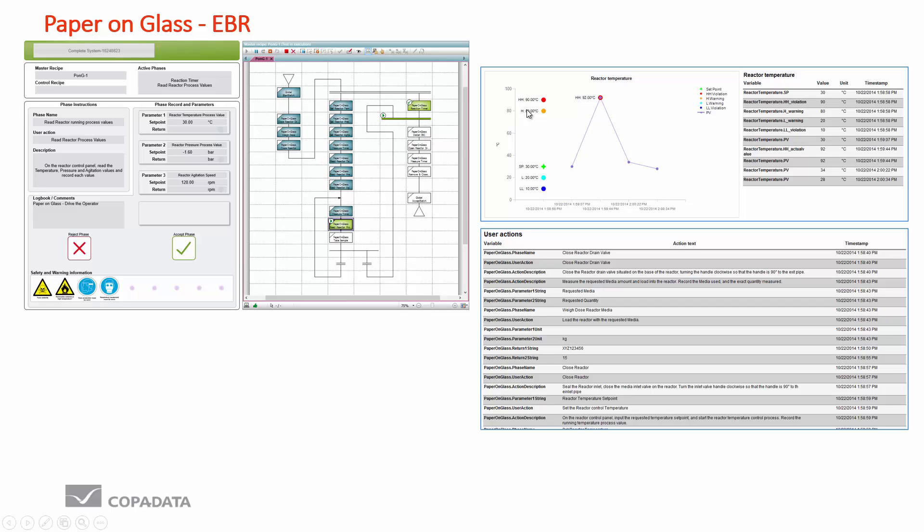We can separate data out into certain areas and create very visually impacting reports. Here we're looking at a temperature process variable and we can see the evolution that this process variable has taken throughout the batch. We can very clearly see there's been a violation here with the HH warning. We also get the value that the violation occurred at, information about the process parameters that we were controlling to, and a detailed description about the history of that as well.